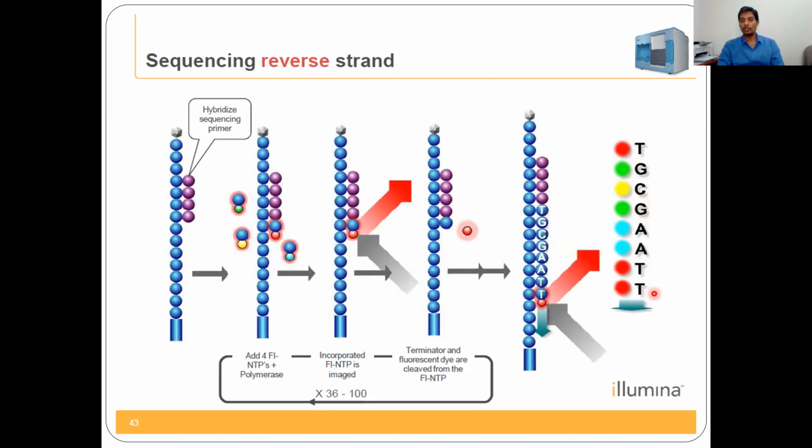So what is the advantage of it? The same cluster. The camera and the software will remember which cluster it is. So the first 300 you found and another 300 from the same cluster, the software gives you the information that the first 300 and the next 300 are from the same cluster.